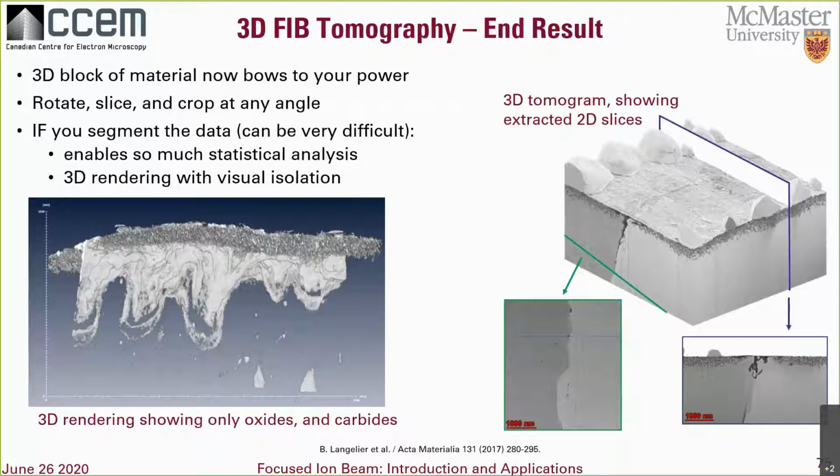If you attended our online image processing workshop, then you'd be aware of the complexity involved in image segmentation and how modern approaches utilize deep learning tools. And if you can get over the huge learning curve of those techniques, then they can make your life a whole lot easier if you're doing a lot of FIB tomography. By the way, the lectures from that workshop are on our YouTube channel if you're interested in seeing them.